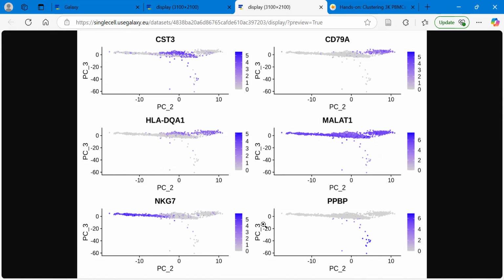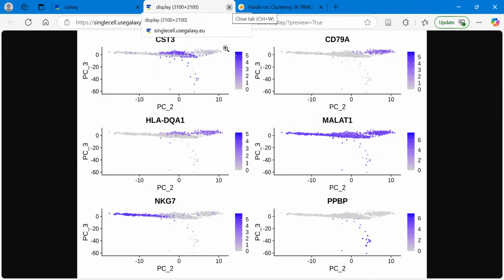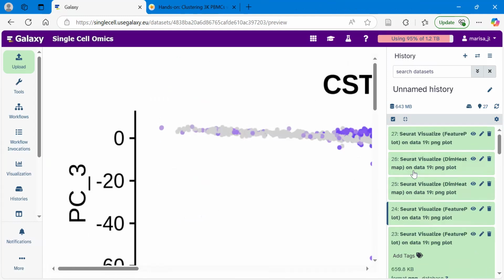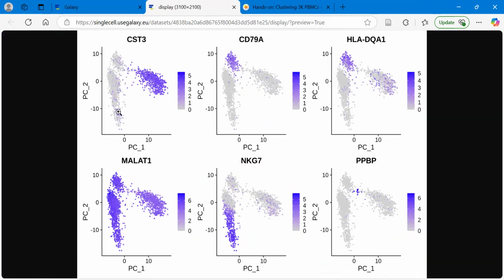So these plots are just explaining to you how these genes relate to the principal components that they influenced. Hopefully if you read through the tutorial, that will make sense to you. And hopefully if you remember to change the number of columns for those feature plots, yours will look a little bit different. There's the one I just reran here. If I click on that and open it up in a new tab, this is what I was expecting to see: because you put them in 3 columns, you've got the 3 positive genes for each axis on the top and the 3 negative ones on the bottom.